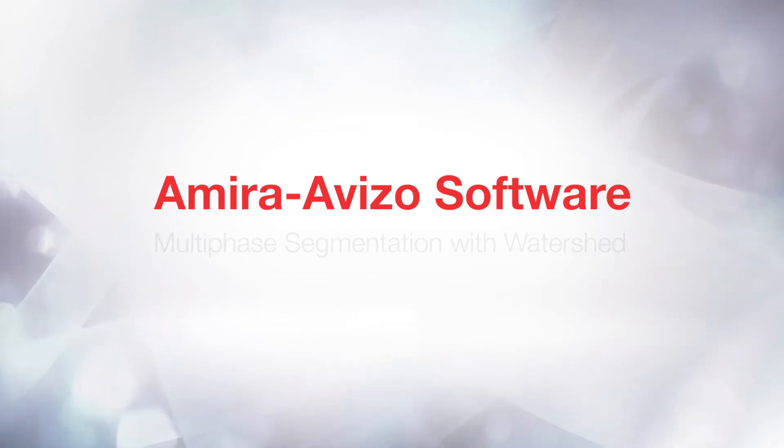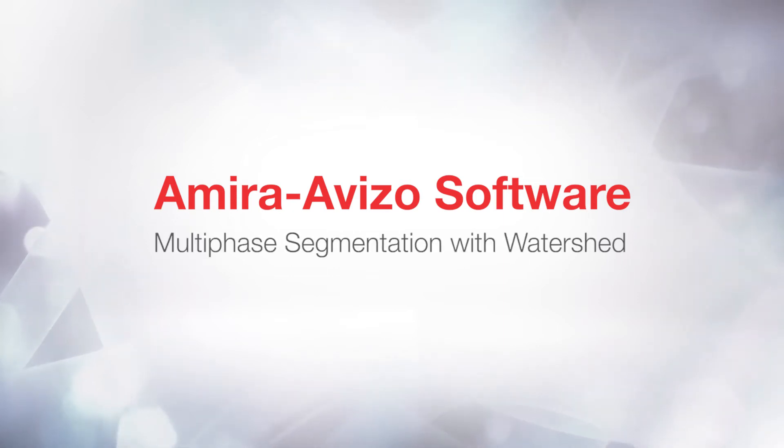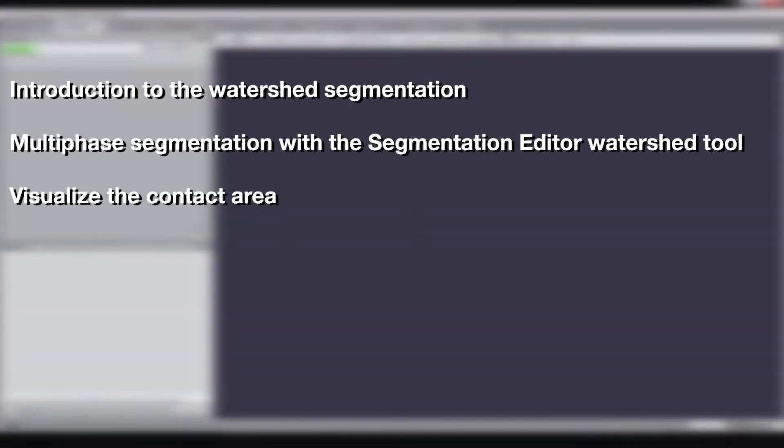Hi, this is Severine from the 3D Applications team. In this tutorial, you will learn how to perform multi-phase segmentation using the interactive watershed tool of the Segmentation Editor.